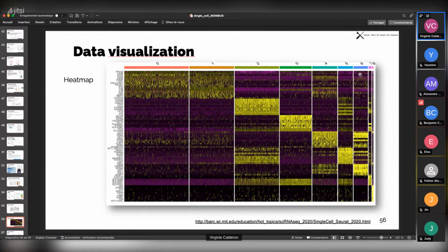If you look at cluster 0 and cluster 1, you see that the profile is the same. Depending on the list of genes, we have pretty much the same profile. For us, it's an indication that maybe we need to aggregate these clusters to form a new one.